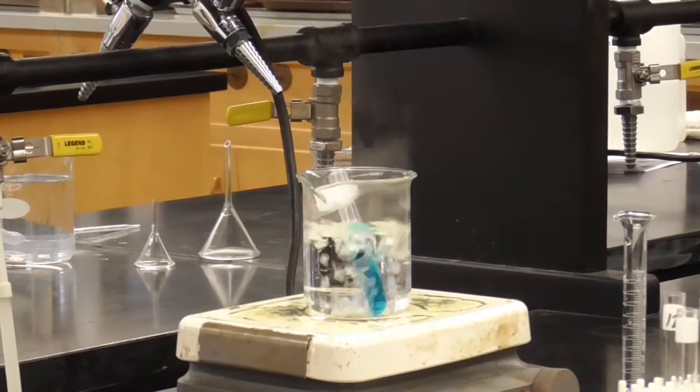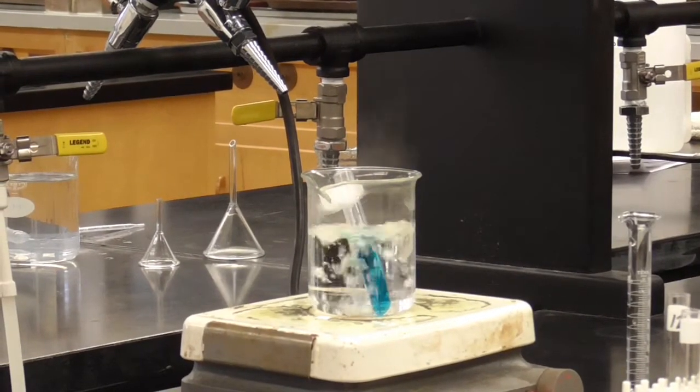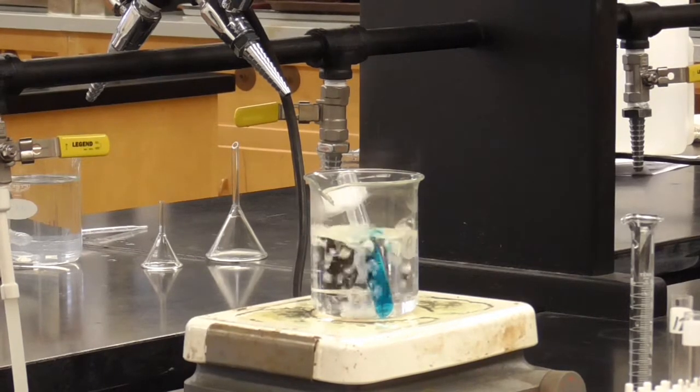All right, come back here. It's been going about a half a minute. So far, it's still very blue. We'll give that the full 3 to 5 minutes and see if we get any glucose occurring.